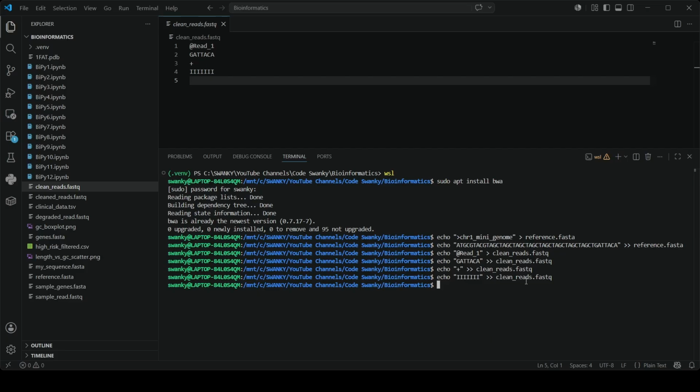Okay, so next step. If I asked you to find the word mitochondria in a 1000 page biology textbook, how would you do it? You would not read page 1, page 2, and all the way to page 1000, right? That takes too long. So you would go to the back of the book, you would look at the index, and it will tell you exactly what page to turn to. Right. So computers are exactly the same.